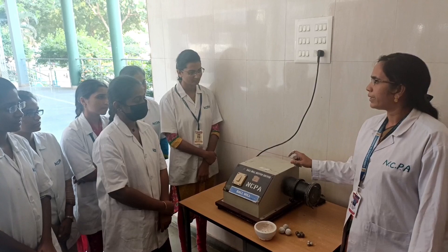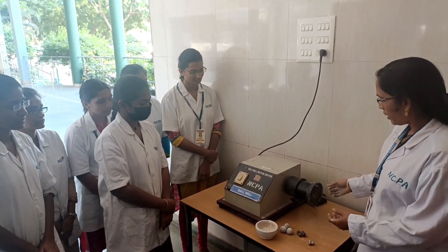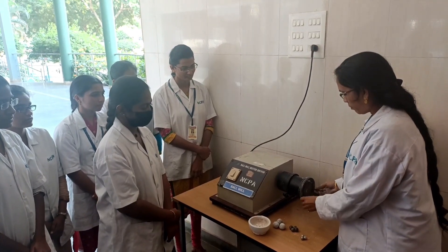The main principle in this Ball Mill is impact and attrition. Here is the equipment — we are going to study this equipment now.